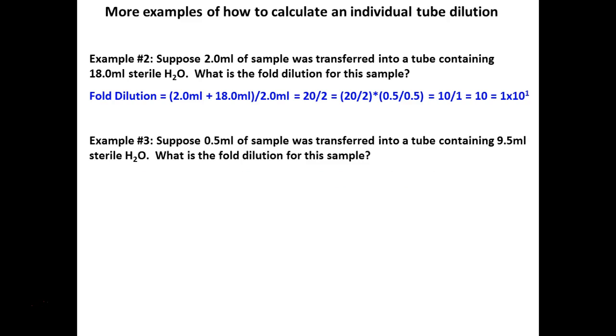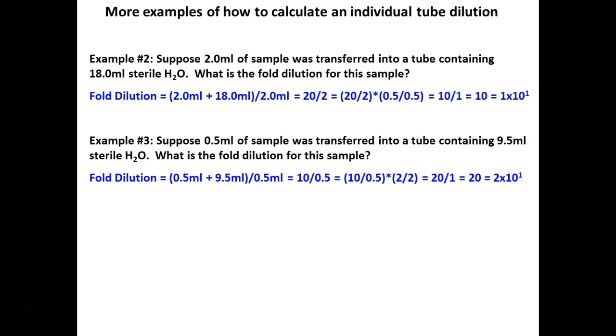Okay, so what about this one? 0.5 into 9.5. So what's your total volume? 10 divided by 0.5. Actually, no, this one's 20.